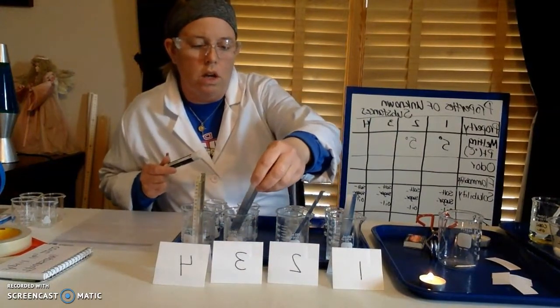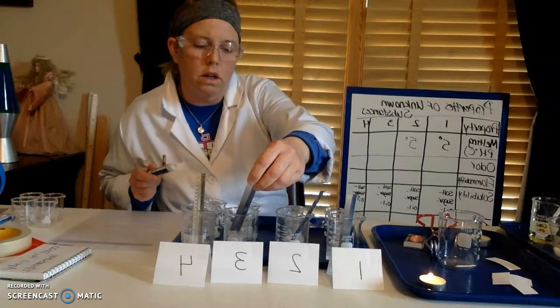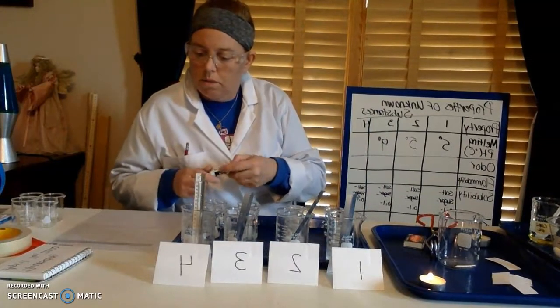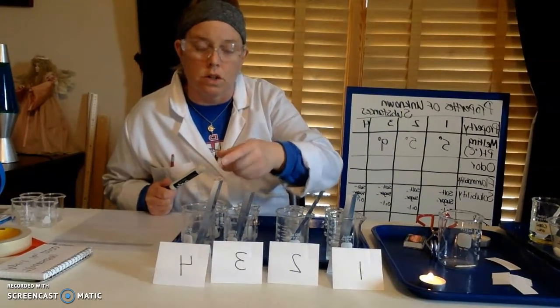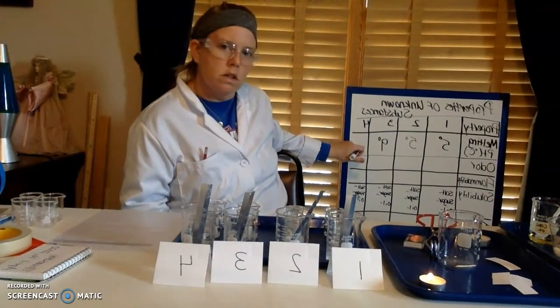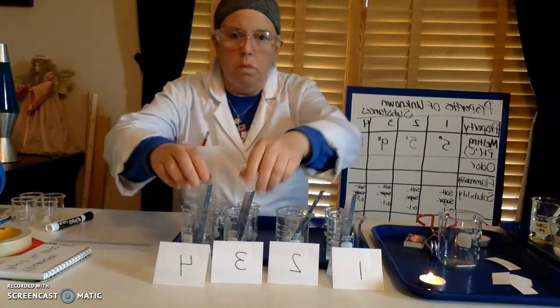In liquid 3, I want to note that this one never really did freeze. It is at a temperature of 9 degrees. And liquid number 4 is also one that struggled a little bit to freeze. It's more of a slushy. I like slushies. That would be a good description of it. And this one is actually right about at 1 degree. Interesting. 1 degree.